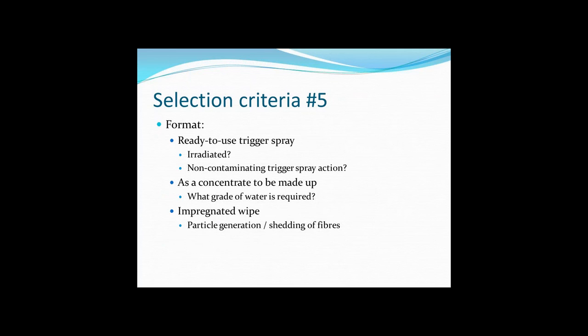Then there's the format. Which format do you want the disinfectant to be in, and does it matter? Does it need to be a wipe, a concentrate, or a trigger spray? Are all three types useful to you, or just one? If it's a trigger spray, have you ensured that when the trigger's pressed, there's no risk of air going back in and contaminating the solution? And what's the expiry date of that trigger spray?